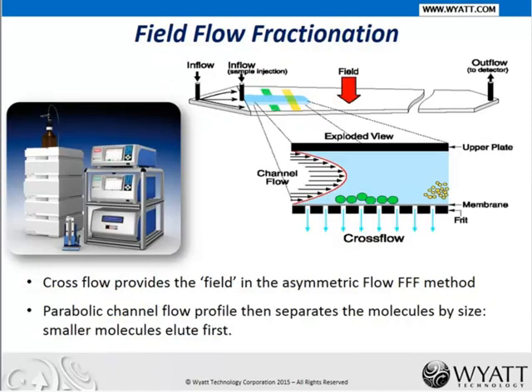The last light scattering related tool I'm going to discuss today is the field flow fractionation together with the light scattering detectors. In the modern field flow fractionation, usually the channel width tapers down towards the outlet, so it's known as asymmetric FFF. In FFF, usually a field is applied perpendicular to the channel. Depending on the type of field, we can have different types of FFF techniques.